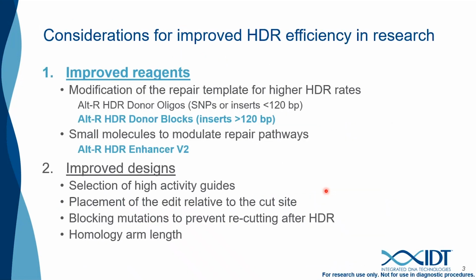Now, the main point of our talk is considerations for improving the HDR efficiency in research. When you consider the two repair pathways, NHEJ is very predominant. And so one of the biggest challenges for HDR is just improving that overall HDR efficiency.